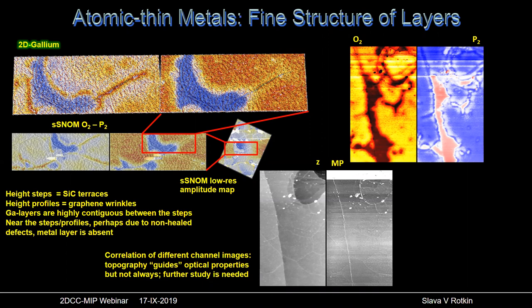And then in this particular region, you see semicircular pits that are formed in the silicon carbide, which means that most likely the decomposition in this area went further, and most likely we have more layers of graphene on top of the surface of the silicon carbide.